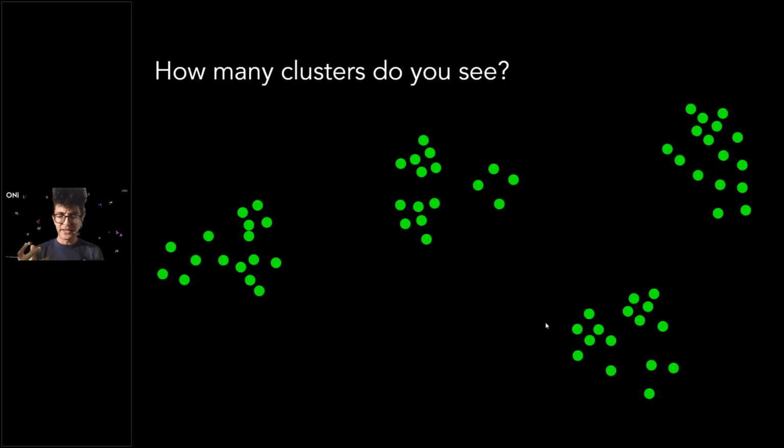I think it's also healthy just to take a moment to think about how the human brain forms these clusters. We look at these points, how far away they are from each other, and we say locally, these points are roughly the same distance away from each other, so maybe that is a cluster. And all of the algorithms that people have developed in the clustering world are to deal with that natural process and try to formalize it into some maths. Obviously, we want to use quantitative methods that are encoded in algorithms so that our data is not being affected by the bias of what we see as humans, but is reliably and consistently analyzed in every case.